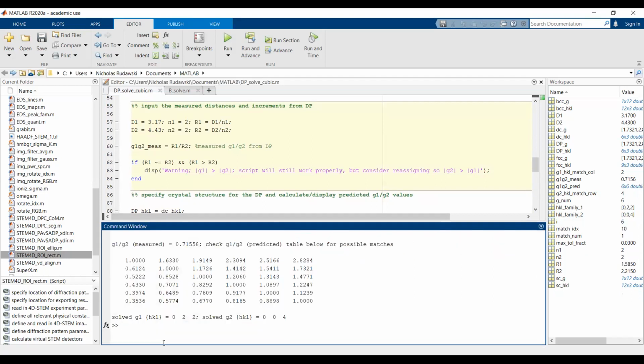So it's only giving me one solution here. The way I have this coded, if there's only one hit, it only gives me that answer. So there's only one reasonable solution here. And we can see very quickly that yes, this does dot to zero. We can get a mathematically acceptable arrangement. But let's just look through the table anyway. So it's giving us this ratio. So really nothing there. Right here, we're close, but the rest of these, there's really not a good match here, here, here.